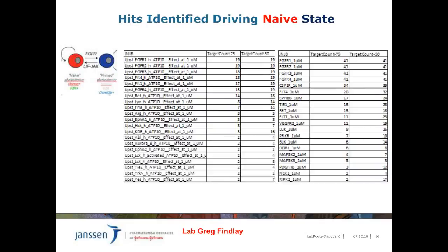Here are the results of the signature analyses for hits identifying compounds to drive the naive state. Both the DiscoverX and Millipore matrices were analyzed by signature analysis separately.